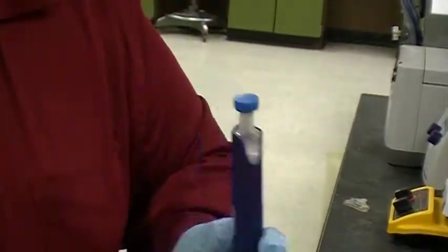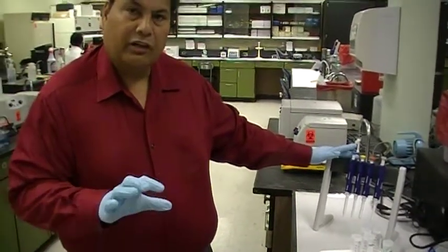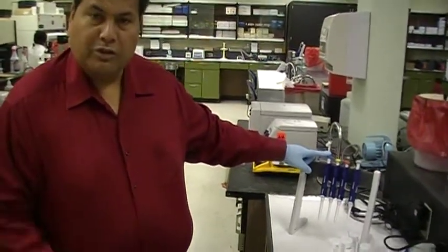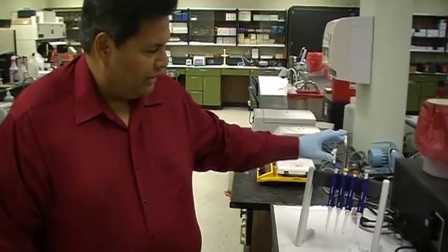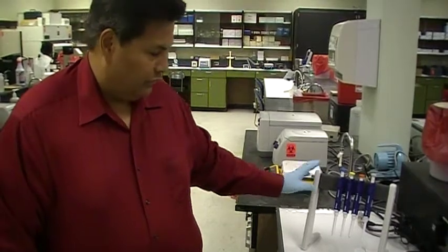Perhaps what we need to begin with is the colors. As a student, you need to commit to memory the different colors, because it saves you a lot of time in the lab. For instance, the blue stands for the P1000, which will measure large volumes up to 1,000 microliters. The yellow will measure volume up to 200 microliters. The orange will measure volume up to 50 microliters. And the gray will measure volume up to 10 microliters.